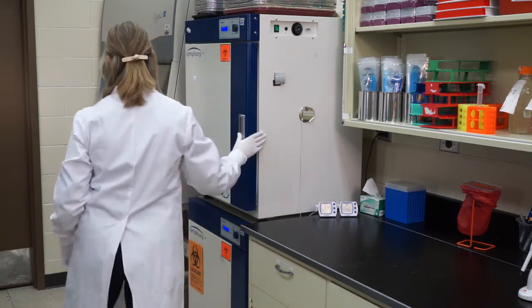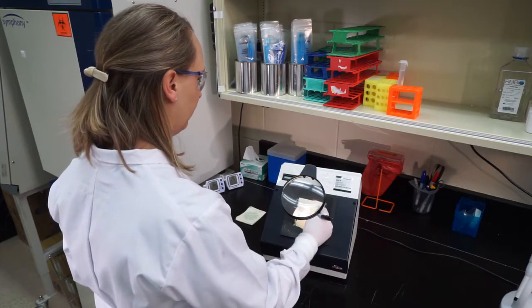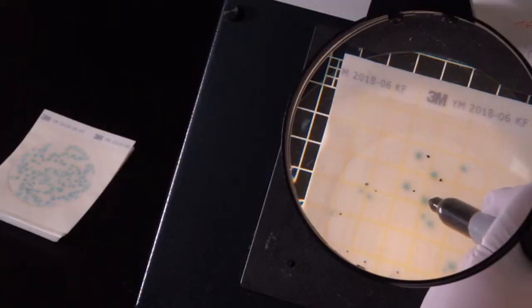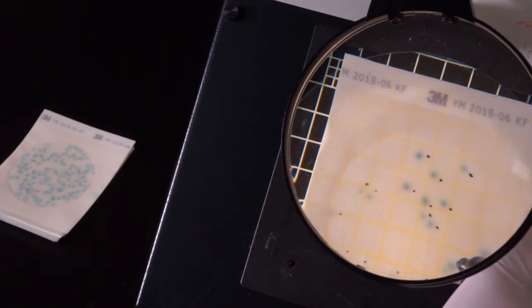Third, interpret. Indicator dyes in each 3M Petrifilm plate facilitate colony counting. Use a magnifying glass, hand counter, counter pen, or mark directly on the plate's top film to tally the results.